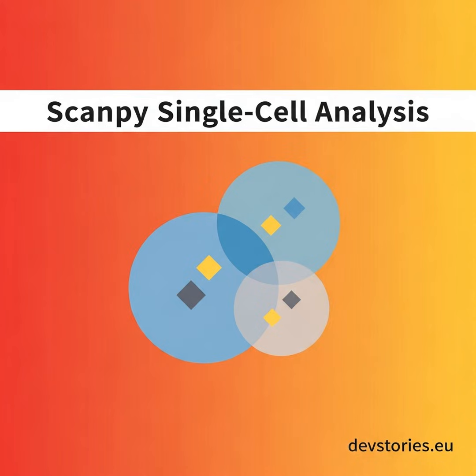Users often default to UMAP for all dimensionality reduction. Understand that UMAP is an embedding technique optimized for finding distinct clusters and preserving local neighborhoods. Diffusion maps are fundamentally different. They preserve the continuous mathematical probability of transitioning between states. This makes them the ideal choice for analyzing continuous processes like cellular differentiation.